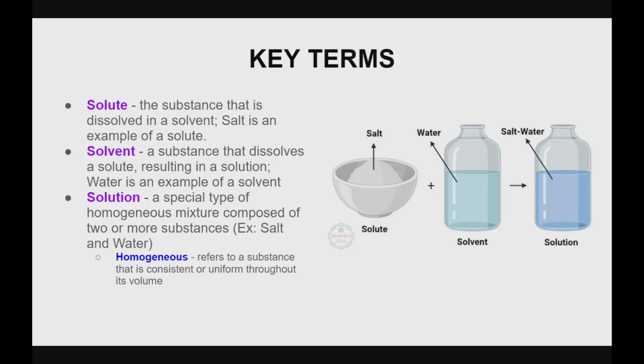When we are making solutions, we are assuming a uniform mixture, and we do everything we can in experiments to make sure that we have a uniform distribution. Because if we don't have a uniform distribution, it can throw our experiments off and they will not be as consistent. So we always want to make sure we mix our solutions and they're homogeneous.